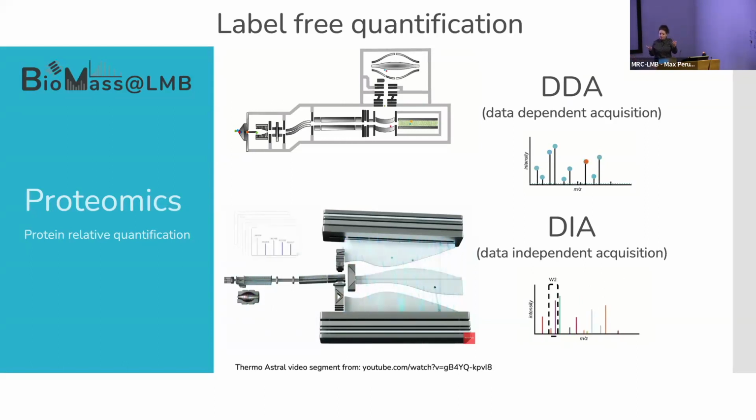So why are we doing DIA versus DDA? What's the story? Basically, it depends on the speed of acquisition of your mass spec. DDA is quite good, especially if you have instruments like ours, which are Orbitrap instruments that are very accurate, but they are slow because that's what they do. It takes time for them to acquire.